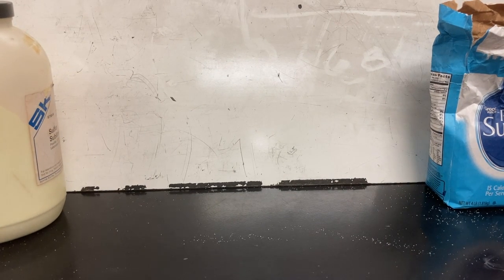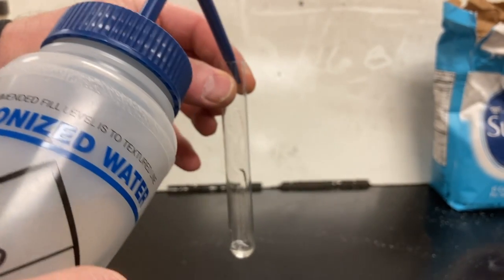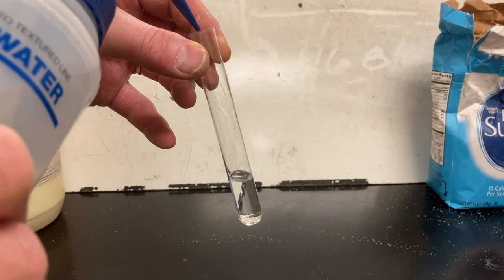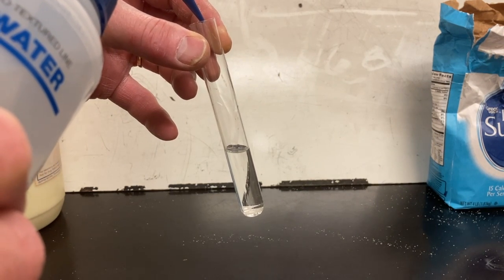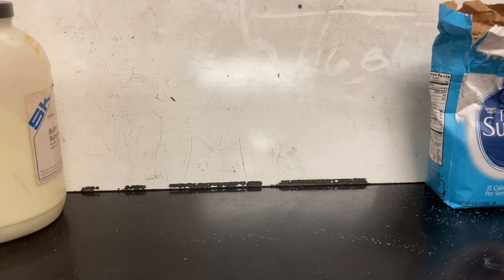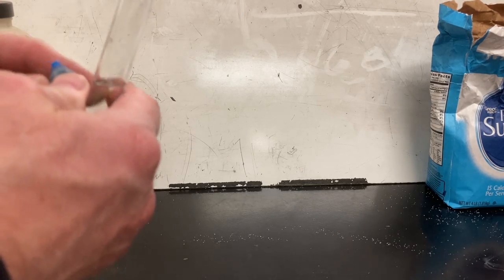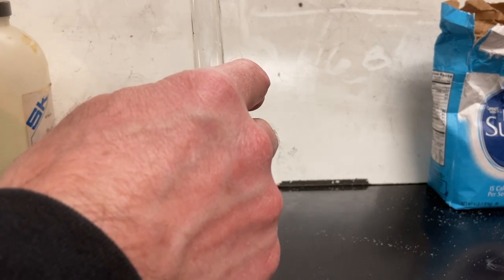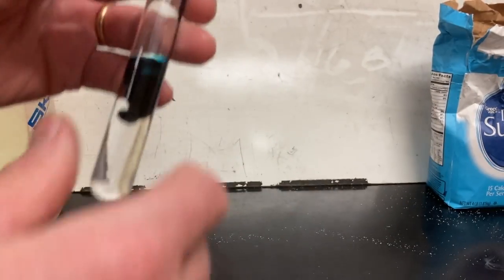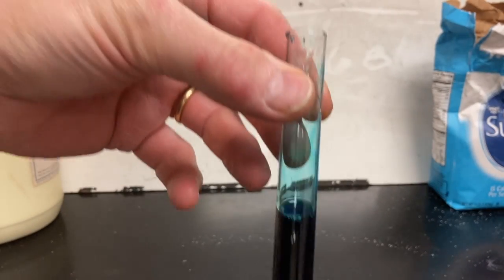I'm going to make another mixture. I have deionized water again. I'm starting out with water. I'm going to put some in the bottom of a test tube. And like I did in the previous mixture, I'm going to put a marker in the water. I'm just going to put a little blue food coloring so we can keep track of where the water is in the mixture.